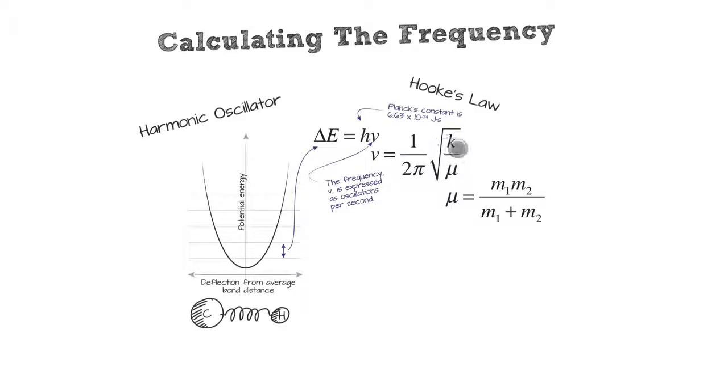The force constant for the spring, which is how strong the spring is. And the stronger the spring, the higher the frequency. So that seems to make sense. The bigger that number, the bigger the frequency is going to be. Divided by the mass of the object that's being vibrated. Now that's all fine if your spring is connected to the wall of St. Paul's Cathedral. Only the mass of the object you are operating is moving.